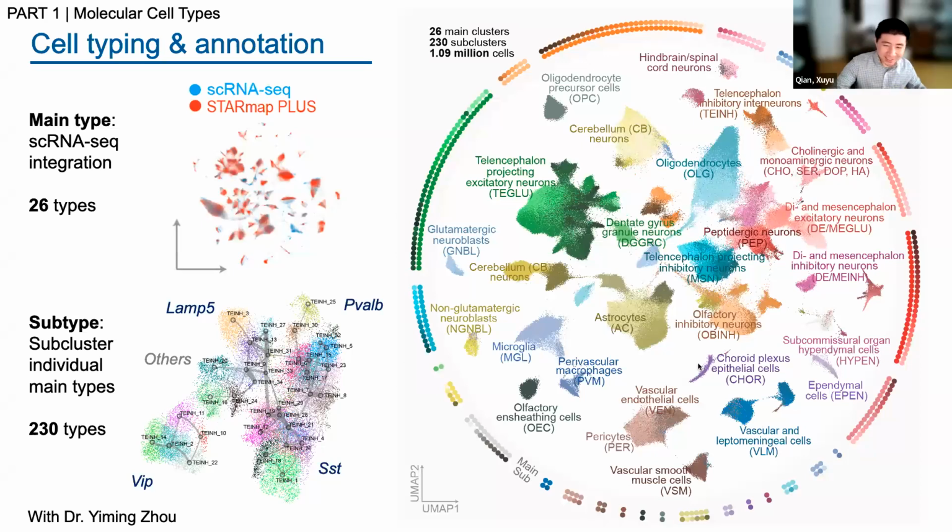Is that just a default GPT or is it a custom chat that someone built? It's just the default. We do this mainly for confirming what we annotated. But in the future, I think there are active research efforts going on to use machine learning and language models for annotating cell types.